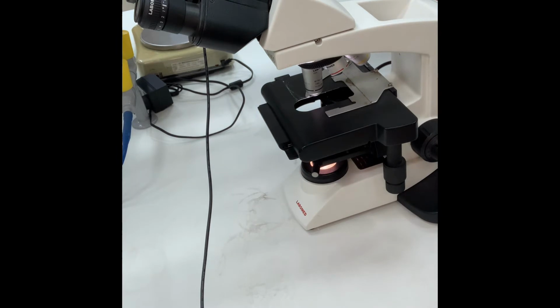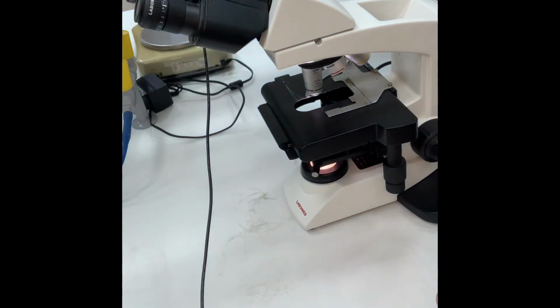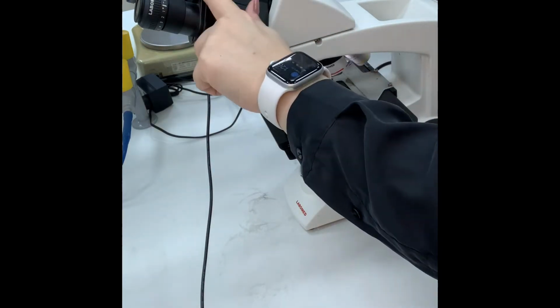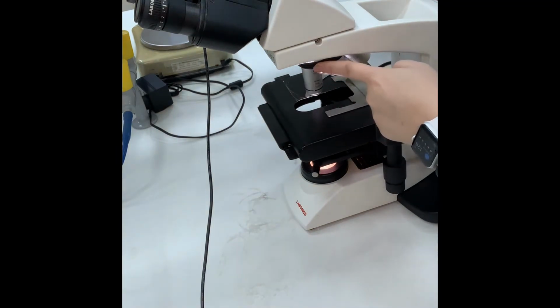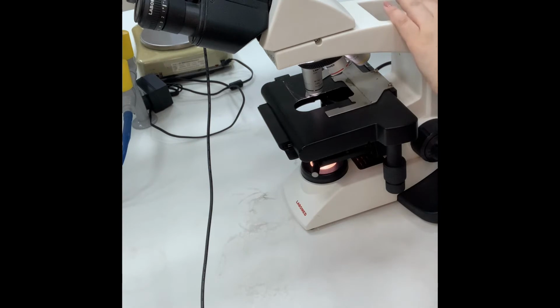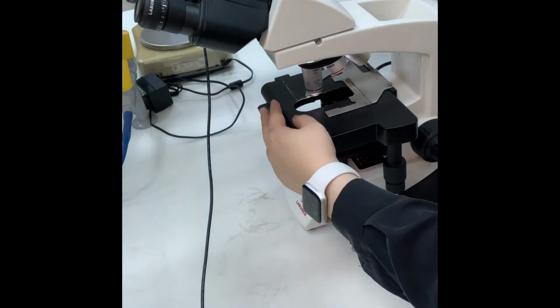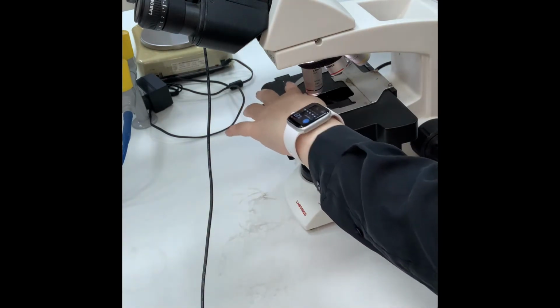So from the top: oculars, lenses that you look through. Head, it carries the oculars. Revolving nose piece, it carries the objectives. What are the objectives? Magnifying lenses. This is the arm of the microscope that carries the stage. This is the lever where you hold the slide.